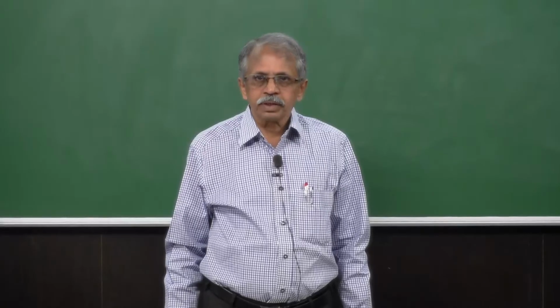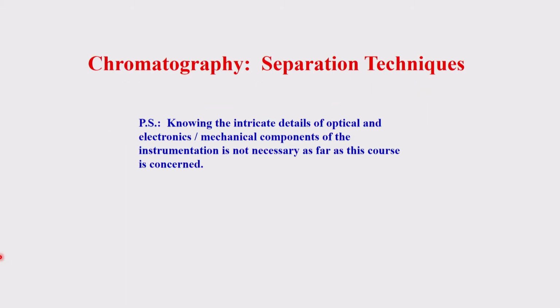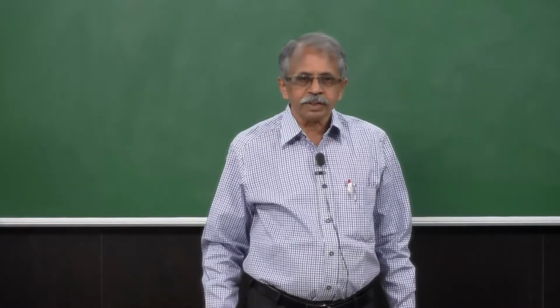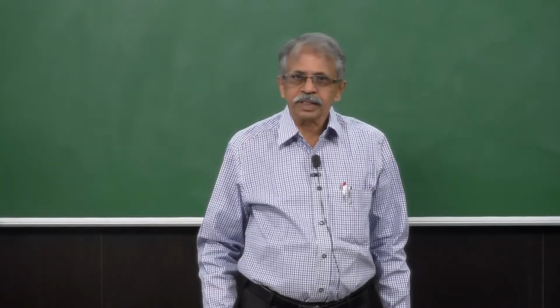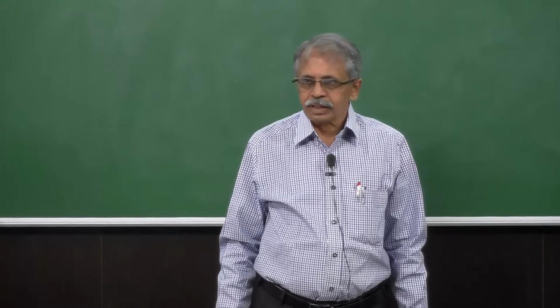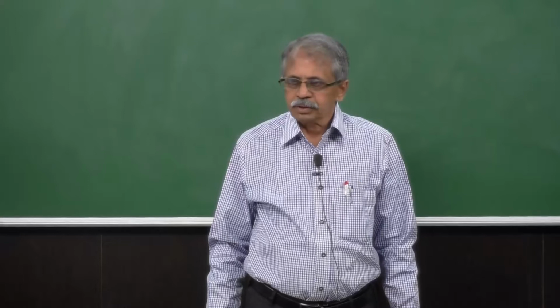Today we will look at, in this particular lecture, something on the separation techniques particularly. The reason why we require separation techniques is that when you do a reaction in the laboratory, for any chemical reaction, you're trying to make something. But you get a product. When you get a product, it is not necessarily true that you get only the product, nothing else. There could be some other precursors, unreacted material, or some impurities, any of these things. So it requires a kind of separation and purification. Therefore, for this course, the prerequisite is the purification or separation. Therefore, I have taken up one more topic to cover in this particular course itself.